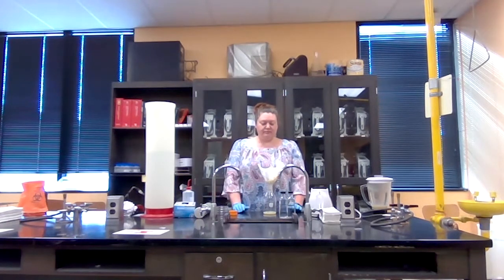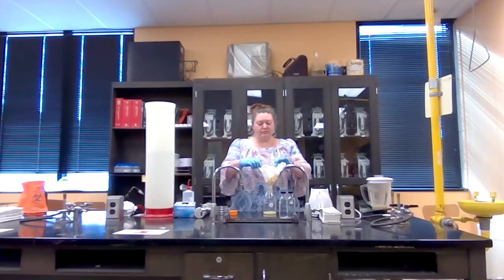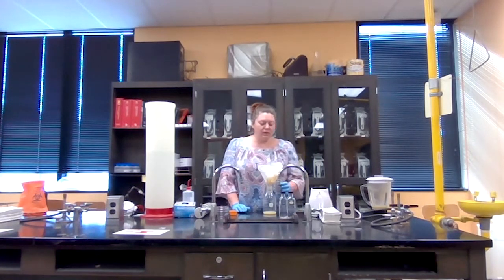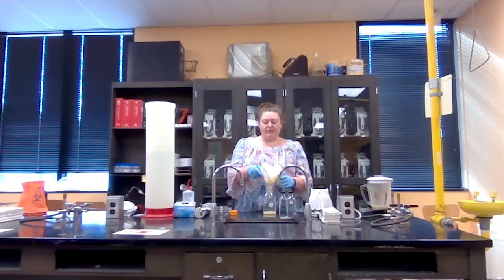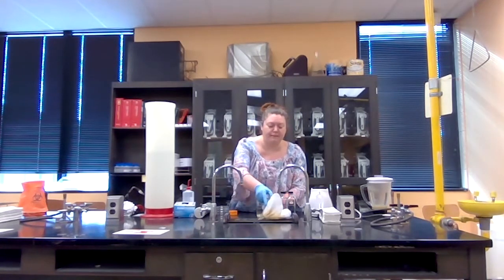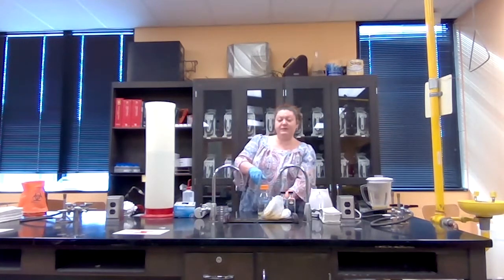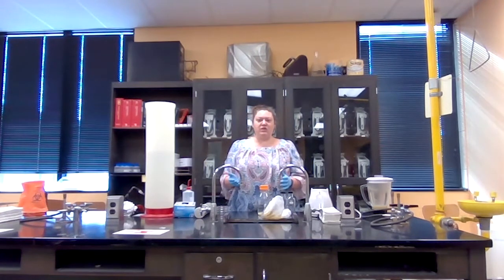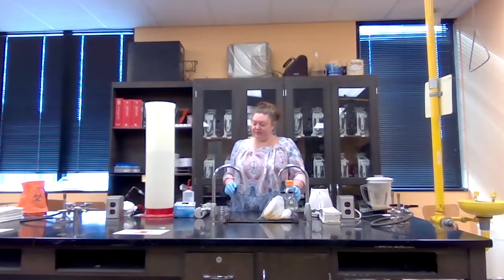Cheesecloth. There's still a little bit more left inside of the cheesecloth, but we don't need that much of the sample. So I'm going to place this over the sink. We have plenty of sample. There we go. And I'm going to put the lid back on there because, again, I want to keep it as clean as possible so that there's not very much of a chance that other microbes from the outside will be able to get into this. So that way it's going to be all Taco Bell in here.